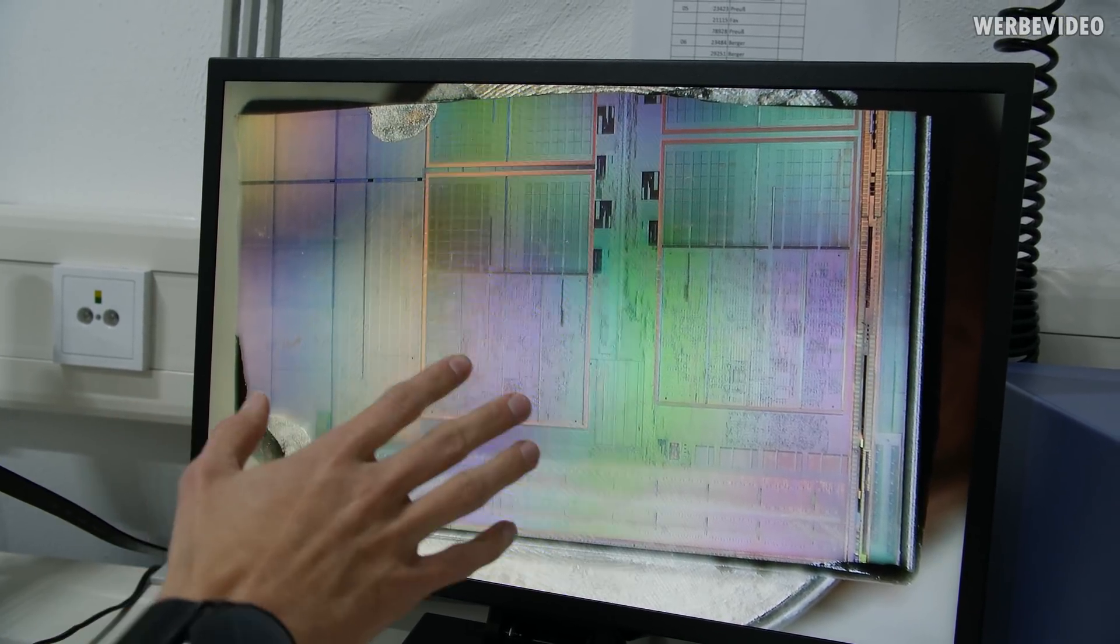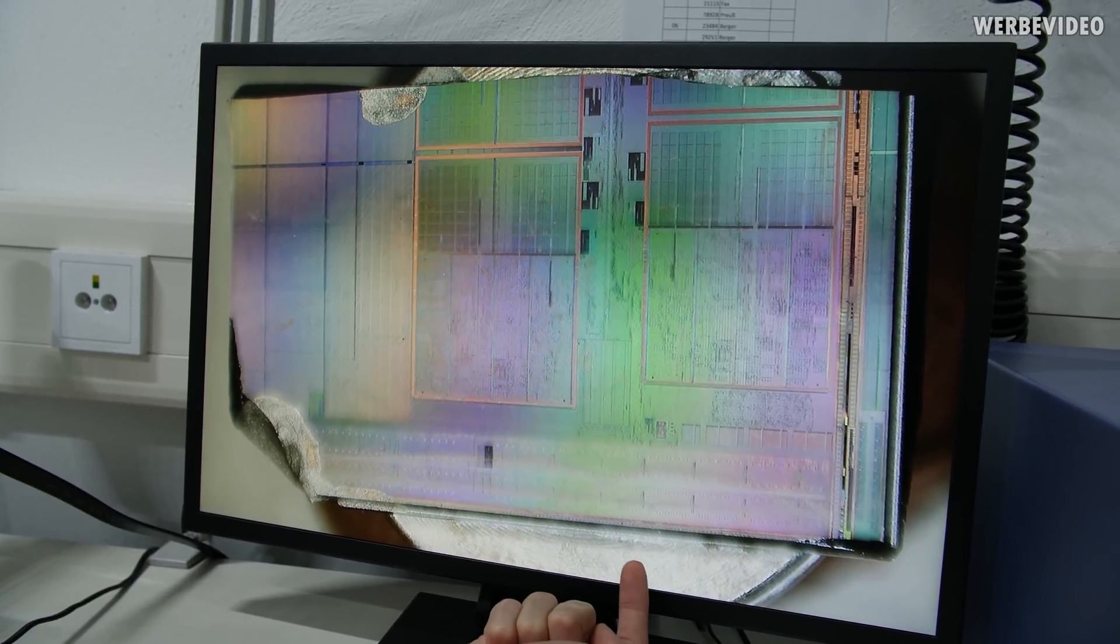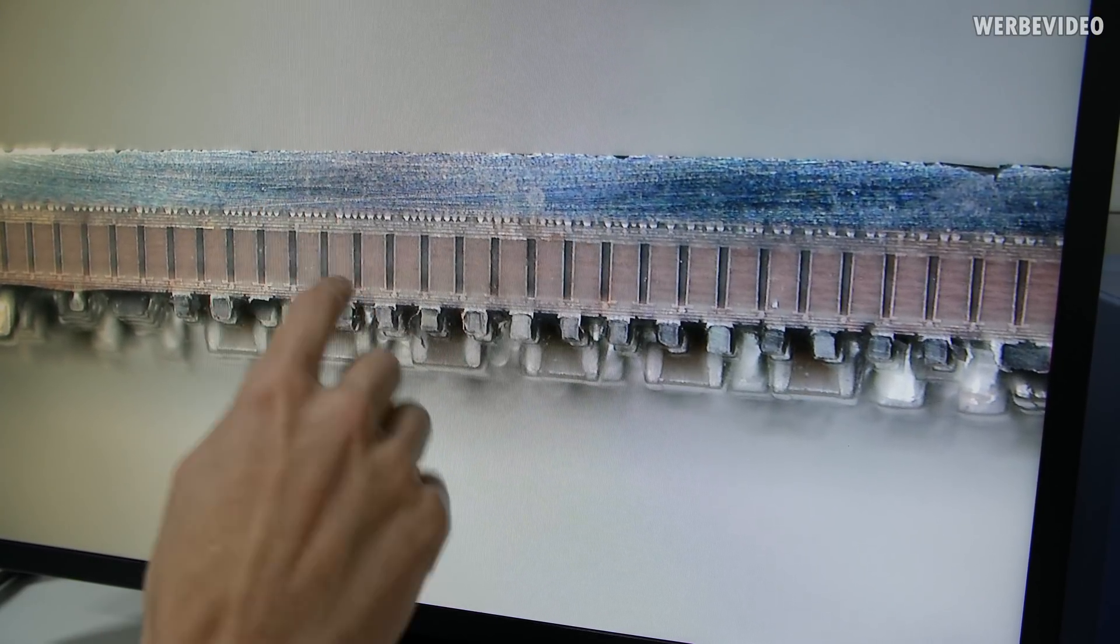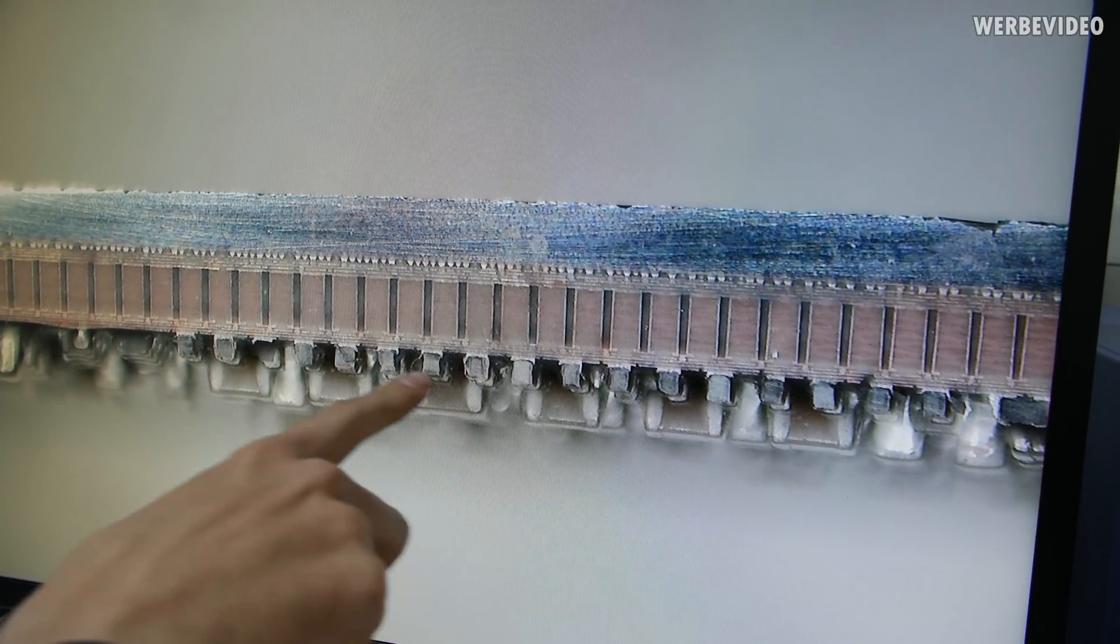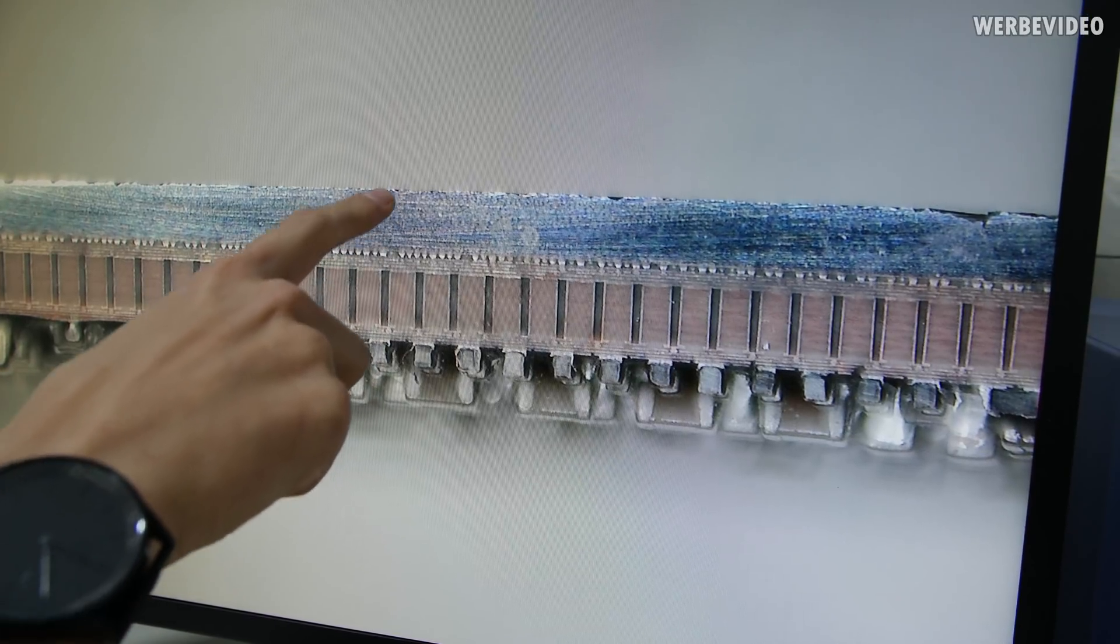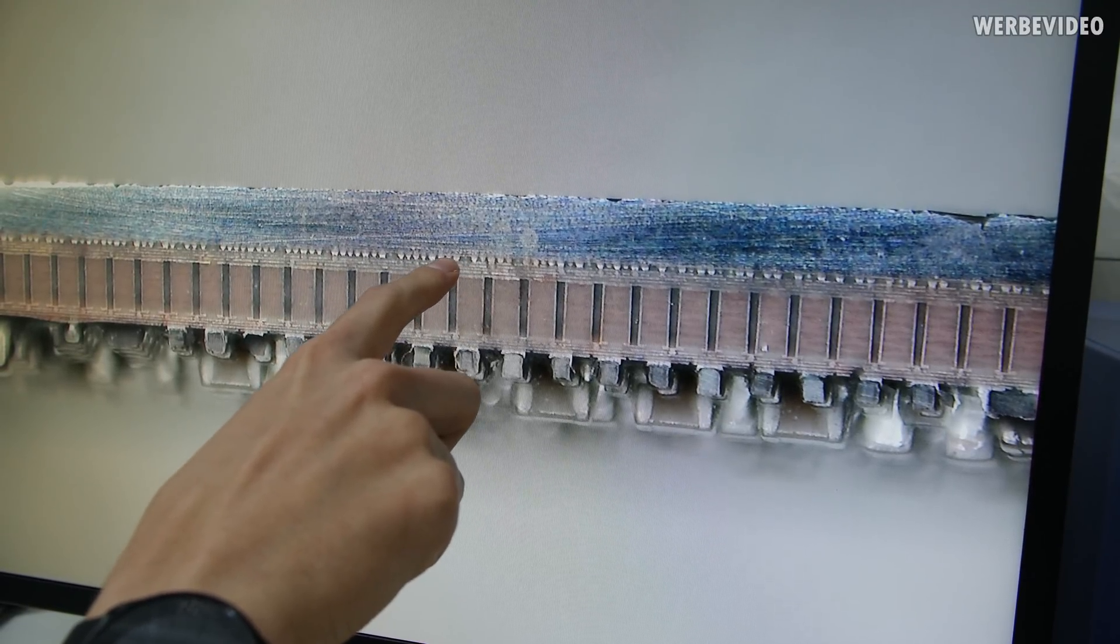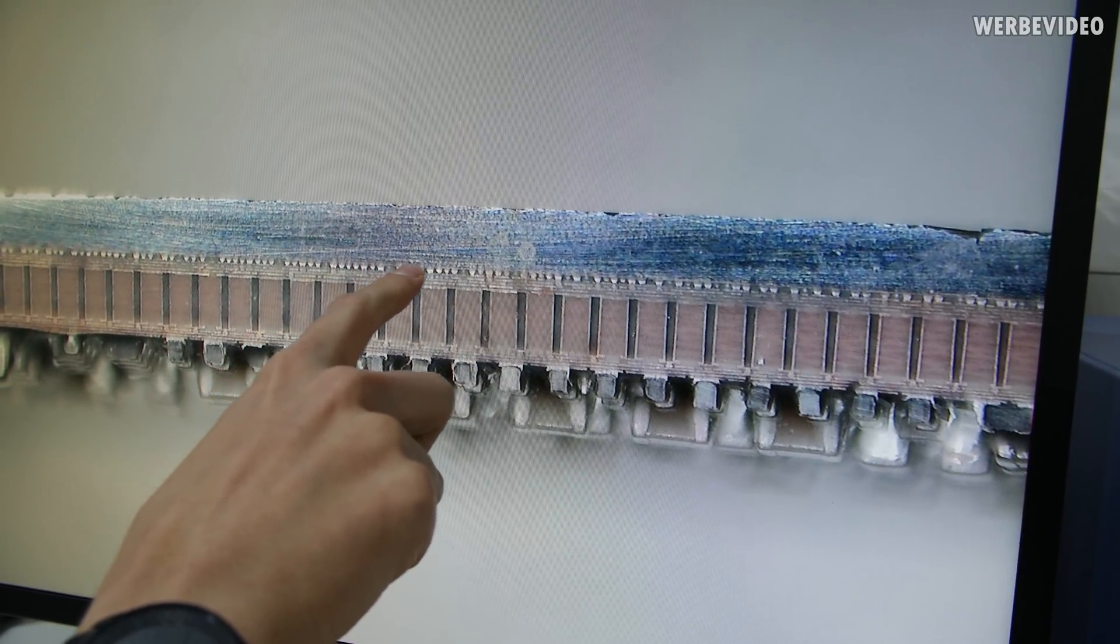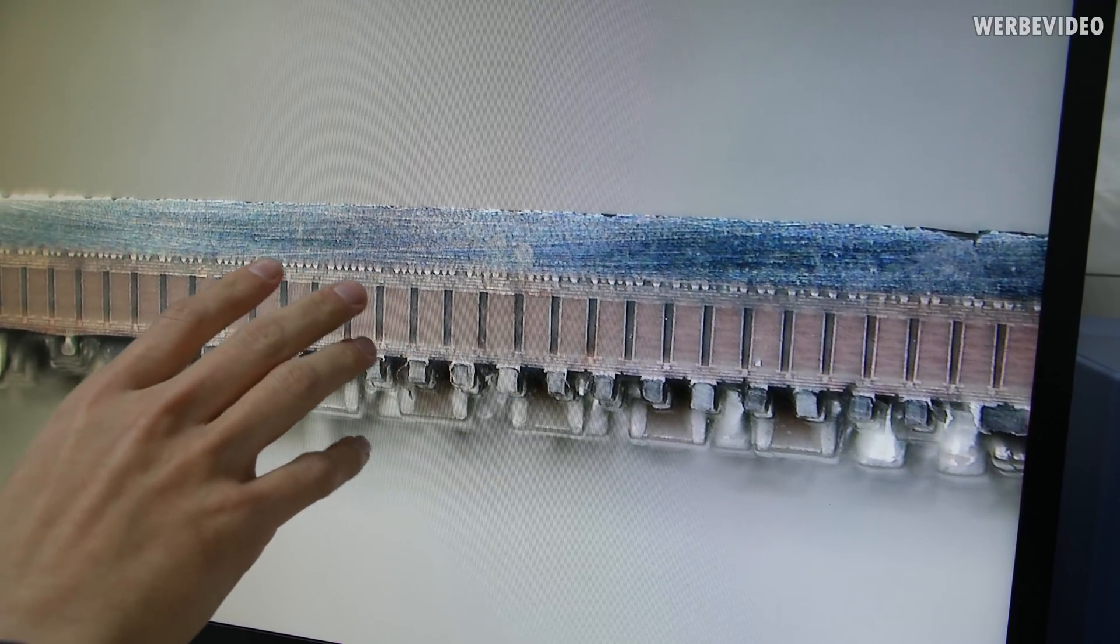Once we did that we can put one of the chips on such a holder. We can take a look at a normal microscope, now you can see the CPU structure from the top. But if we use the SEM and TEM we will take a look at the structure from the side. Now we can see the i9 9900K from the side. This is the cut we performed, this is the PCB which you can see right here. We can see some capacitors on the bottom which we also cut in half. What you can see on top is the silicon, we see some joints in between, some solder balls. What you cannot really see is the structure itself where we have the circuits on the CPU. That's probably what would be this very thin line right here, but even on a microscope like this this is not really visible. That's why we have to move to an SEM or to a TEM.